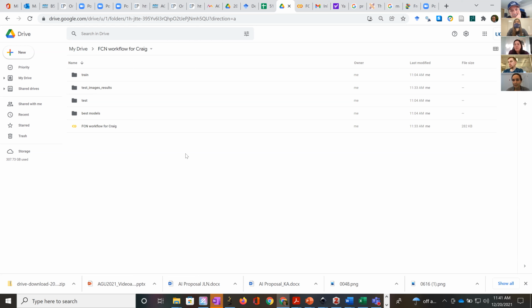About tortuosity, we still haven't, let's say with Devin, I know you started looking at that. So we're still not at this stage to say that we can get tortuosity from this method yet, but it should be possible. I would say why not? But one option, if you're interested in that specific parameter, is to use the segmented stack, which is generated by Colab, and it's super fast.